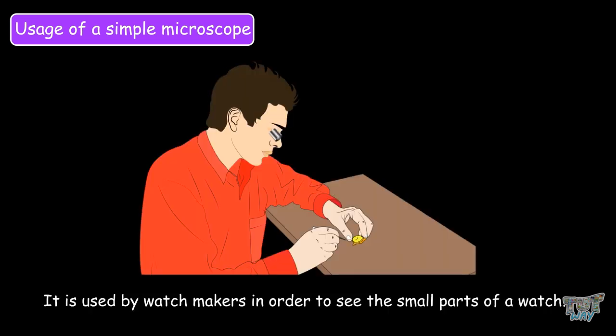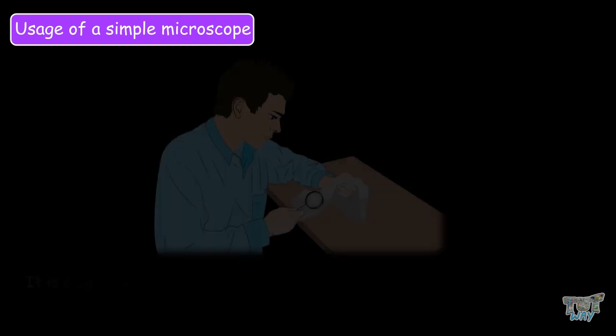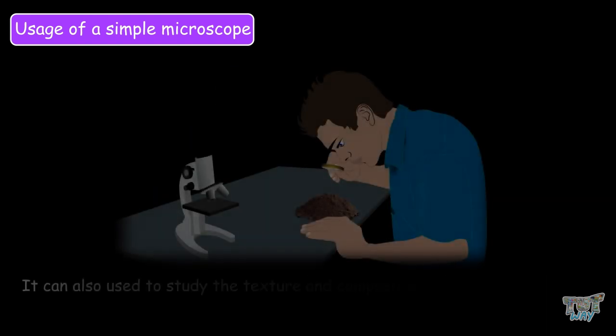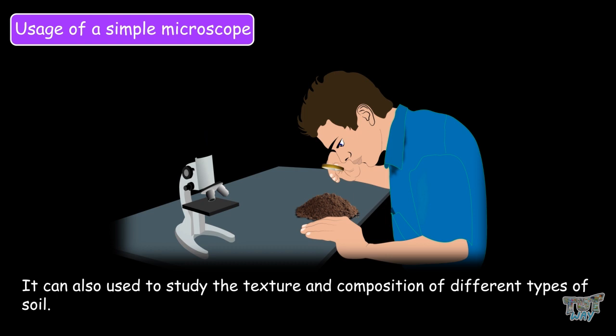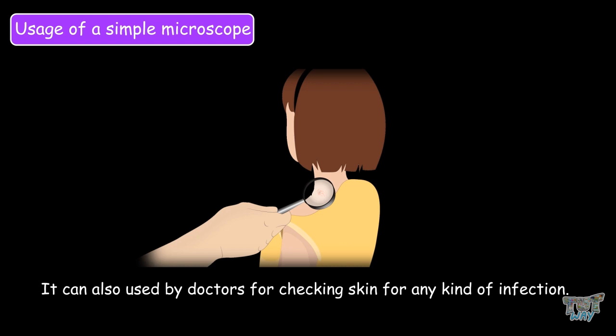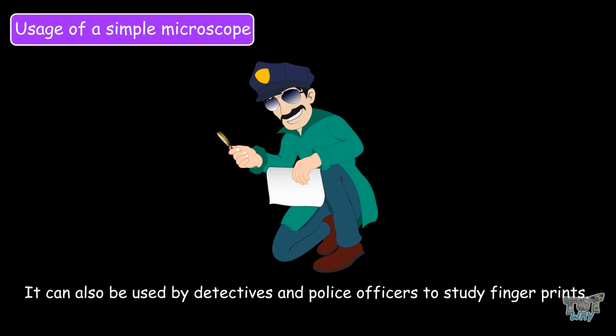Now let's learn the uses of the simple microscope. It is used by watchmakers in order to see the small parts of the watch. It is also used by jewelry makers, so as to make beautiful jewelry. It is also used to closely observe textures of fibers or threads of a cloth. It can also be used to study the texture and composition of different types of soil. It is also used by doctors for checking the skin for any kind of infection. It is also used to study ancient engravings and stones and fossils. It can also be used by detectives and police officers to study fingerprints. So these were some of the uses of the simple microscope.